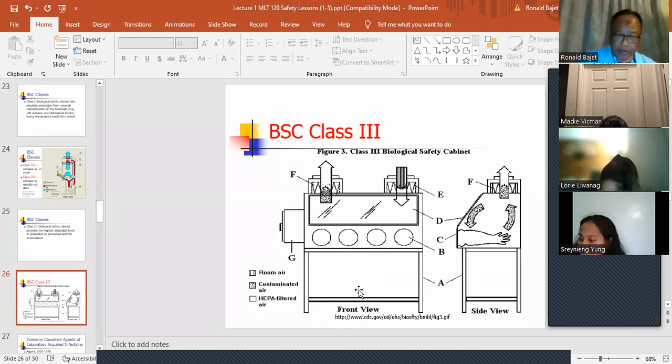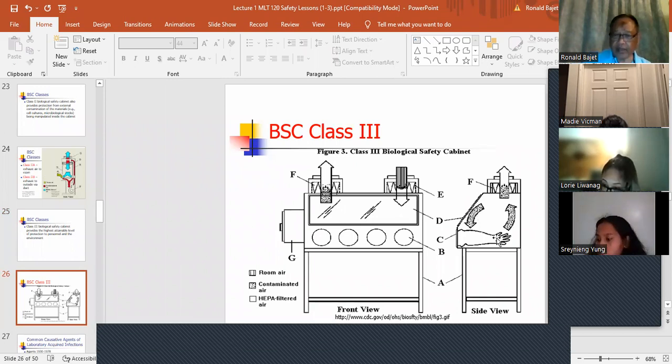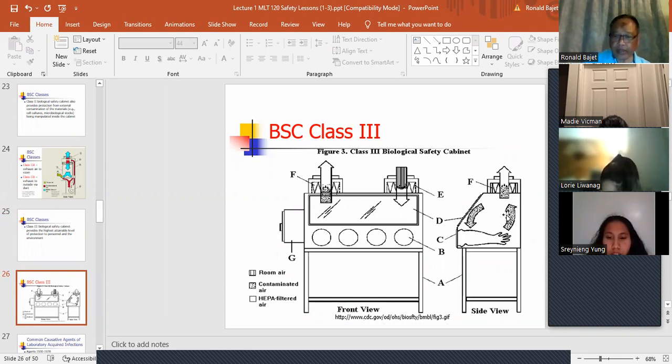When I worked with anaerobes, in one of the laboratories where I worked, they had an anaerobe glove box, and it's pretty neat, where you stick your hand through these circles, and your hand enters a glove, and this is where you will handle the specimen. So this is used in a biological safety cabinet three. Air is circulated, goes through a HEPA filter, and is exhausted out, okay? So this is the BSC level three. It's closed.